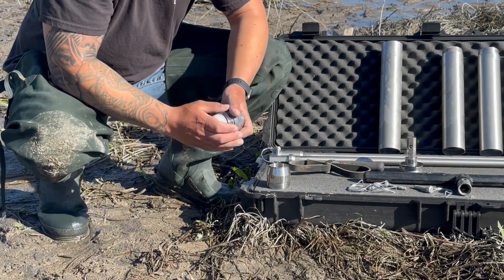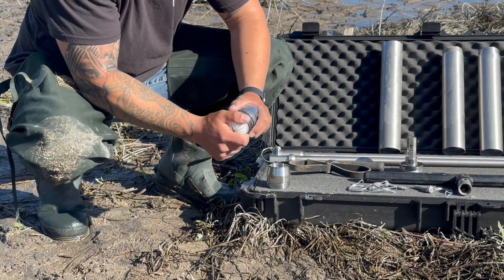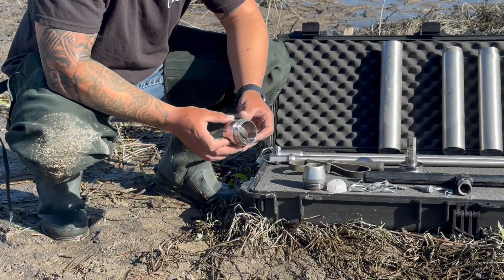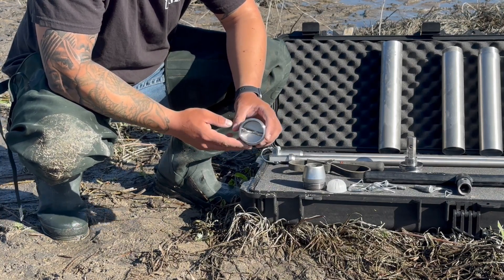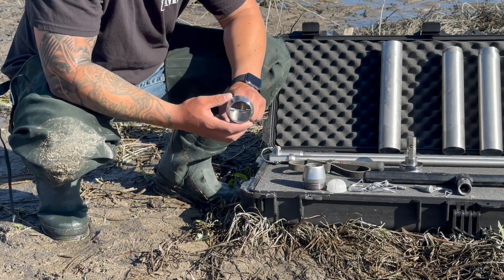Sludge core tips are machined to work with a plastic core catcher as shown here. The valve soil core sampler tip features hinged valves that open as the sampler is driven into the ground and close during retrieval. While a plastic core catcher can be used with the valve soil core sampler tip, the hinged valves serve as a reliable alternative.